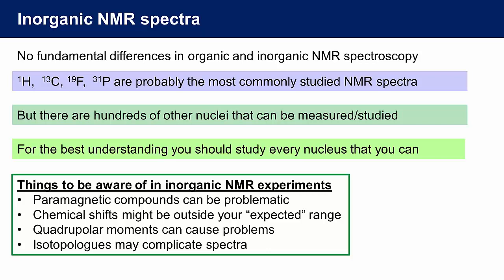It's much more common in compounds containing d or f block elements. Paramagnetic samples can be problematic. The unpaired electrons bring their own large anisotropic contributions to the internal fields, and also provide an additional mechanism for nuclear spin relaxation, which can result in severe line broadening, often to such an extent that you may not see any peaks at all in your spectra.